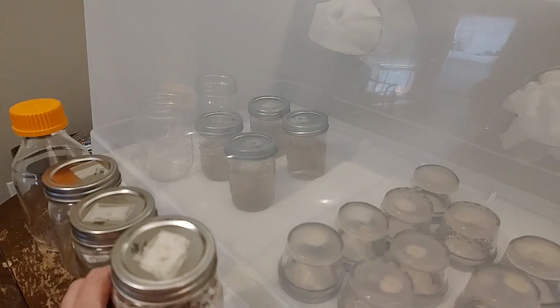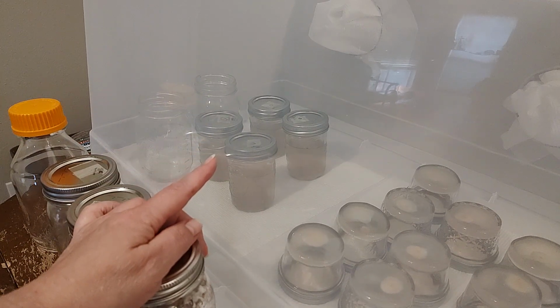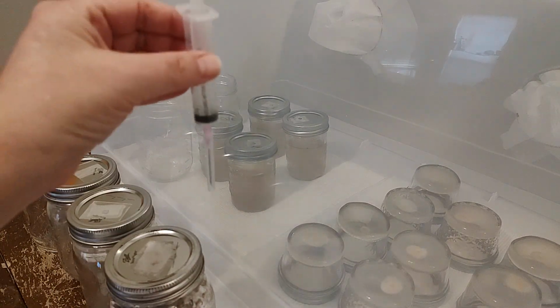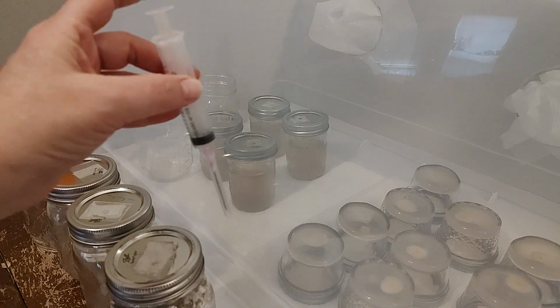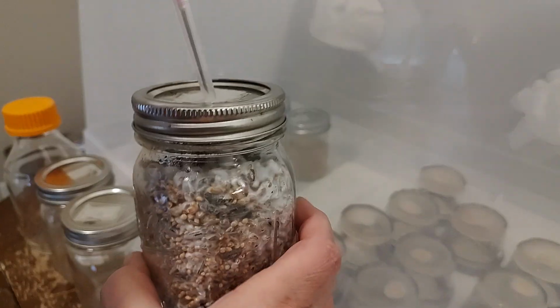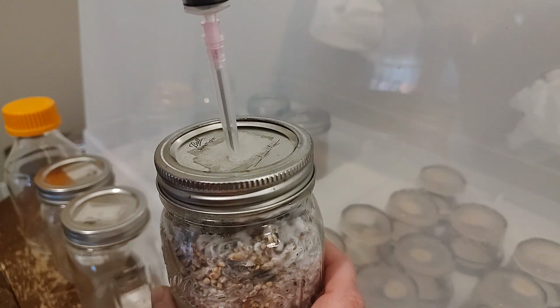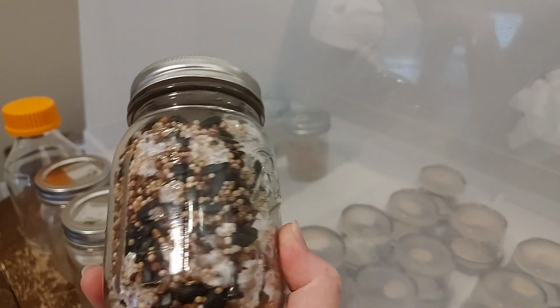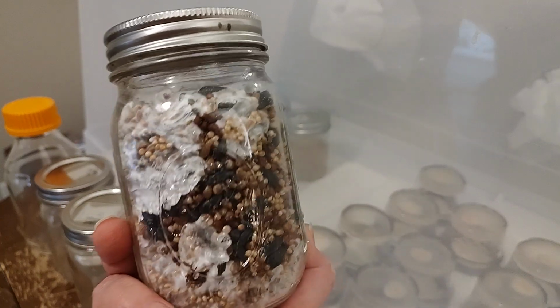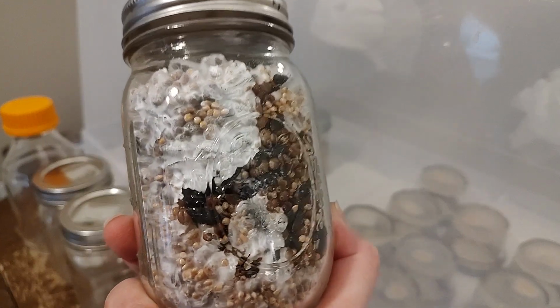And what happens is once you have all this liquid mycelium in here, which I have in my still air box, SAB, and I'm going to do a video, I'm moving them to a larger jar. So you'll have to stay tuned for that. All you do is simply put your syringe down in the liquid mycelium and you just pull it up. And then I have these syringe holes in the top and also for airflow, air exchange. So you just put the syringe in the top, and that's how you inoculate these WBS jars. So again, really easy actually to move out of spores into mycelium.